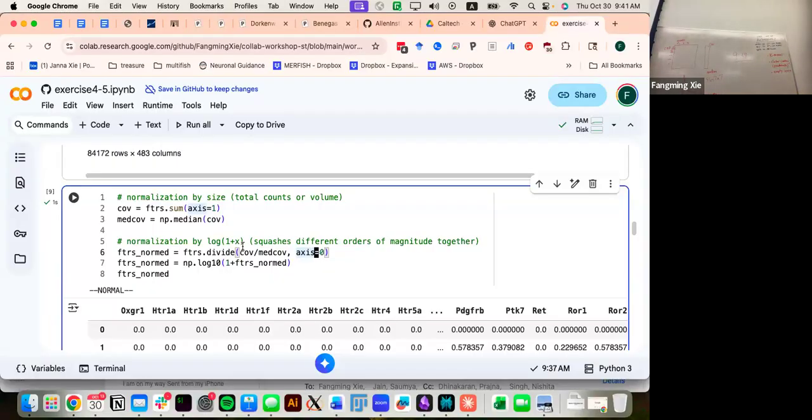So a typical way people make this distribution more well-behaved and remove the influence of outliers is by doing a log. Log 10 here actually means log 10 of x plus 1. So this 0 will become 0 again. This 100 roughly becomes 2, because 10 to the power of 2 is 100. And then 1000 will become 3.